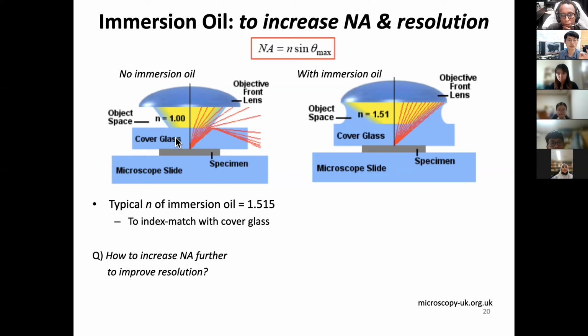Glass has 1.52, while air has 1. So you have to go a little bit outside of this angle. What that means is, as it goes higher, you start to go out of the optical system. You cannot take that information anymore. That's a shame and a problem, because you're losing your information.